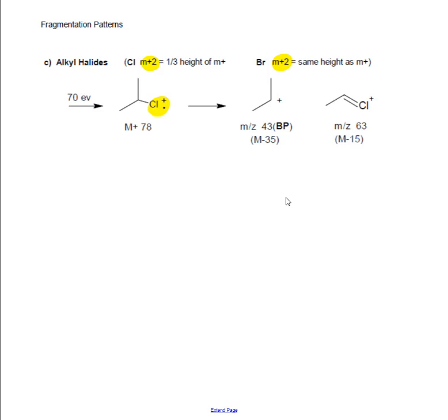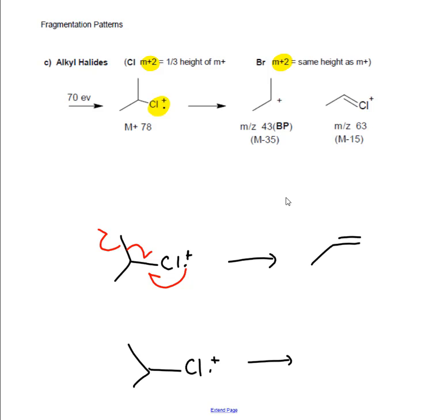And then as far as how you can fragment, well, there's two ways it can go. The first way that you can fragment, I'll do it here so I don't ruin this drawing, is where this right here can make a double bond to the carbon that's holding it, while the carbon double bonds as well, and that leaves a fragment behind that's a radical. So we wind up getting that right there. Okay, that's positive, and a methyl radical. That's this right here, 63. So remember, methyl's 15. 12 plus 3 is 15. So 78 minus 15 is 63.